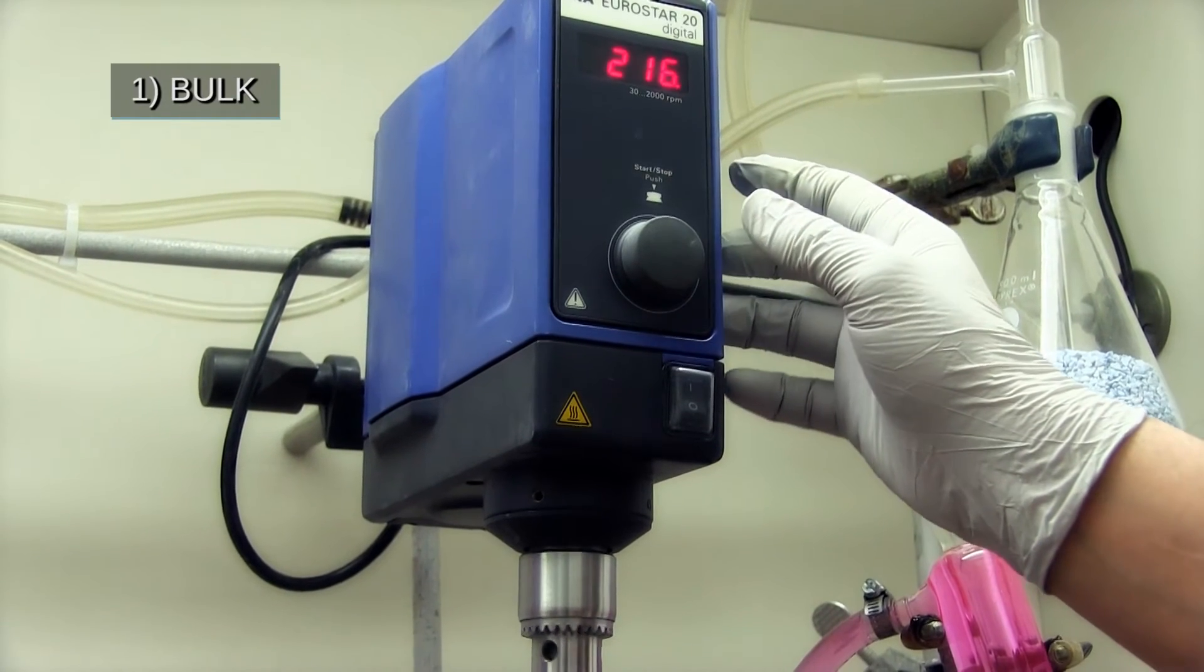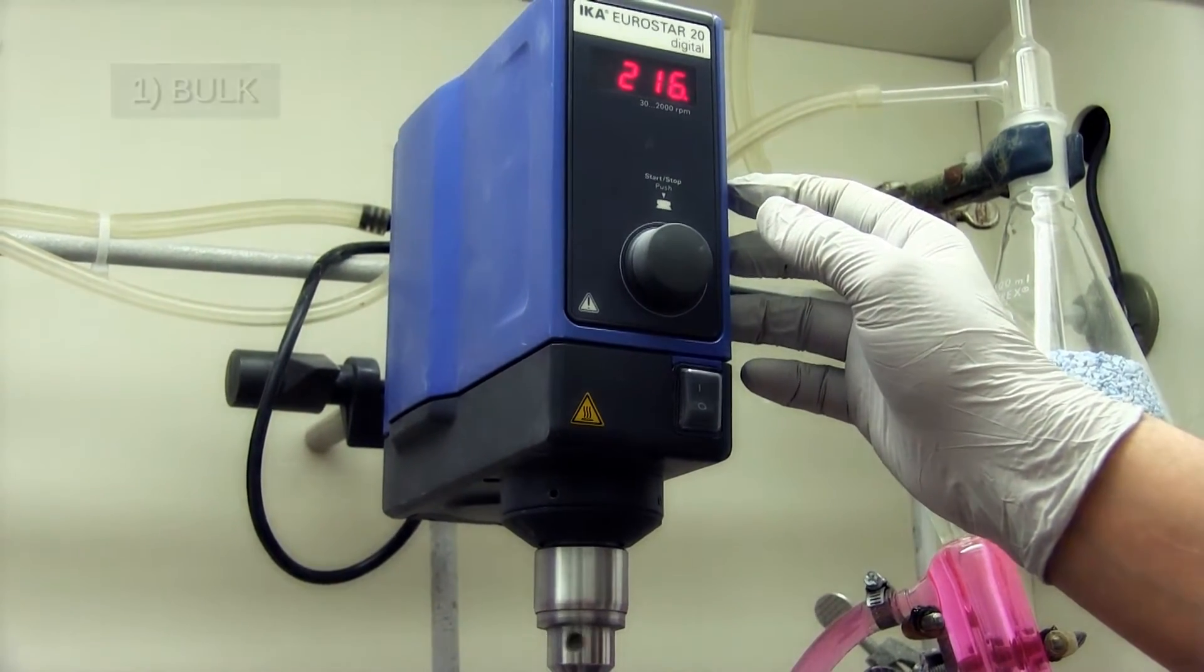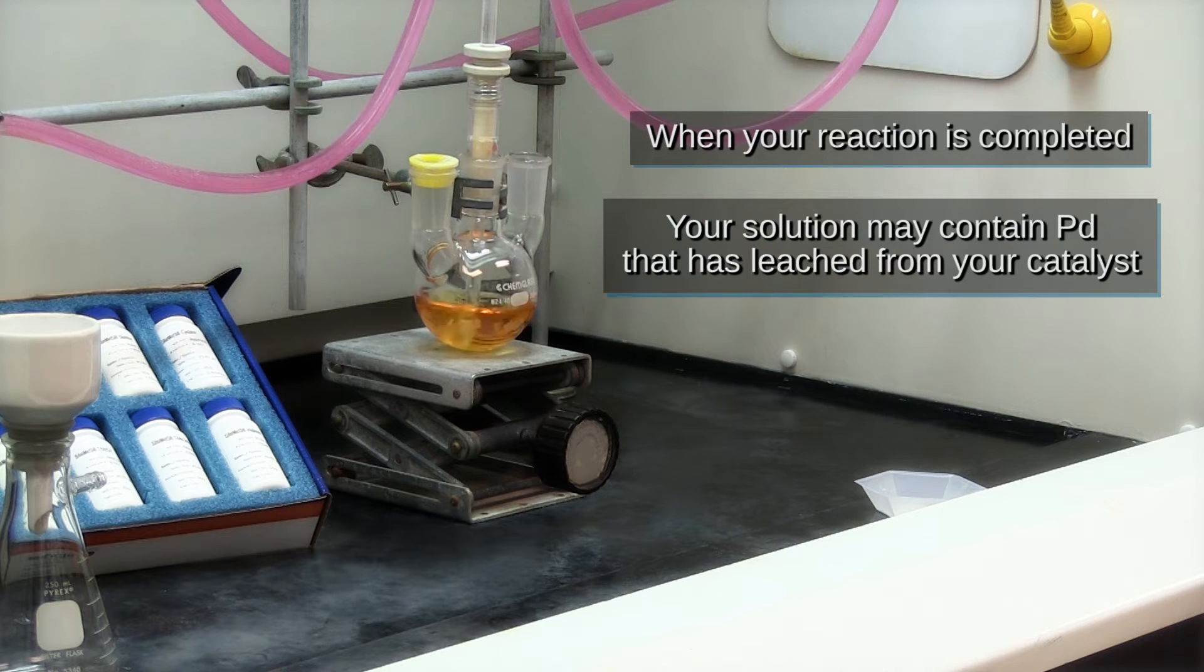Bulk. When your reaction is completed, your solution may contain palladium that has leached from your catalyst.